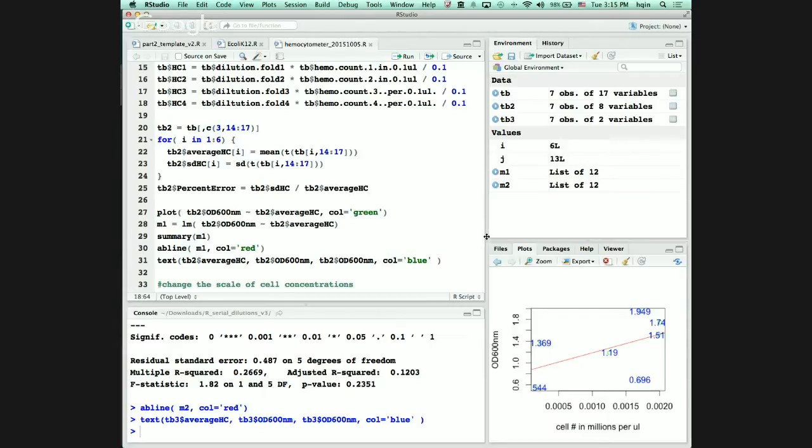What's the error? We deleted it last time. So you just press run and highlight everything, then command save. Did you go to sessions? Did you go to set workspace to open? Oh, okay, I see.